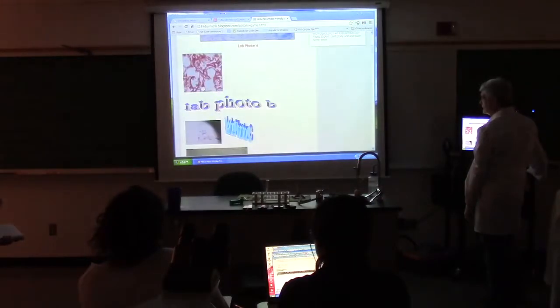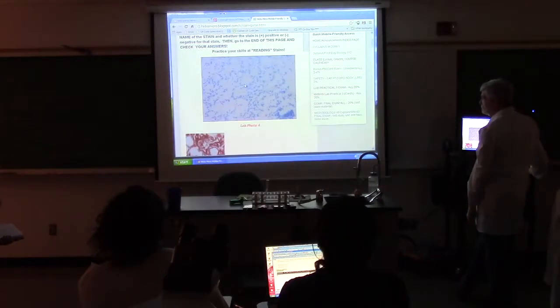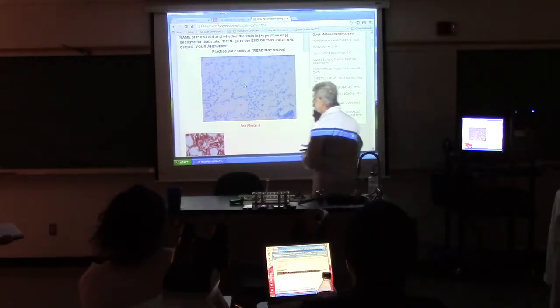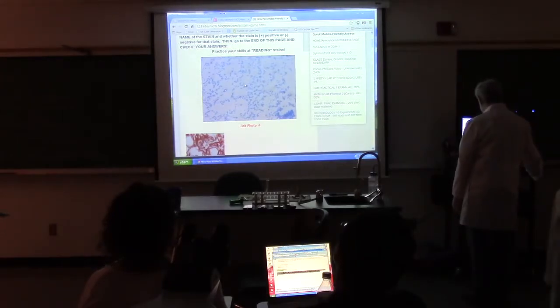Let's just practice these for a second. What stain is this one? Nope, that's blue. Acid fast positive or negative? Negative, good. And it is actually coccoid, so it's a little bit hard to tell there, but I'll make it a little bit more definitive for you.